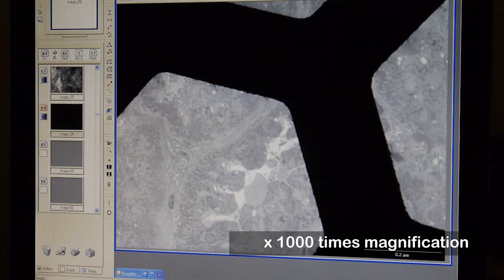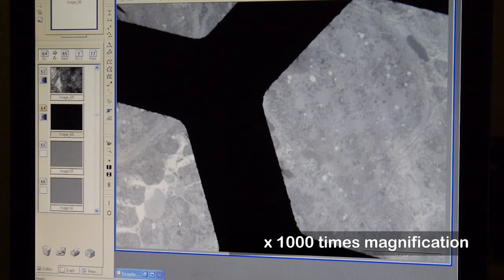At 1000 times magnification, the mesh of the grid and cellular outline can be seen.